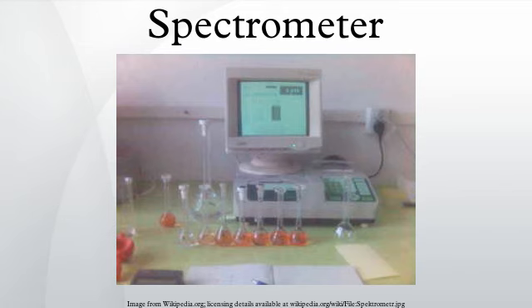In the original spectroscope design in the early 19th century, light entered a slit and a collimating lens transformed the light into a thin beam of parallel rays. The light then passed through a prism that refracted the beam into a spectrum because different wavelengths were refracted different amounts due to dispersion. This image was then viewed through a tube with a scale that was transposed upon the spectral image, enabling its direct measurement.